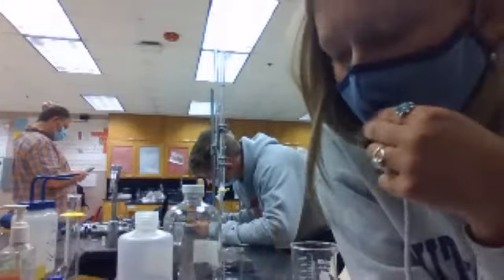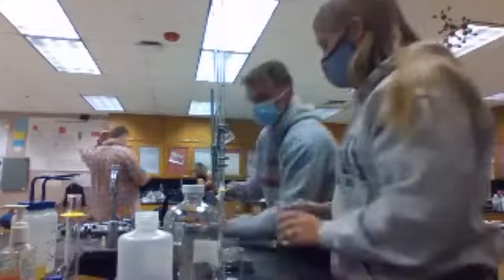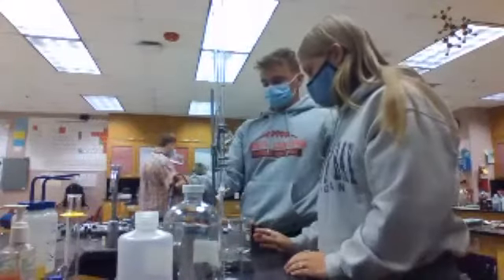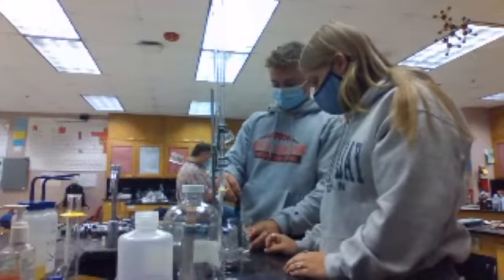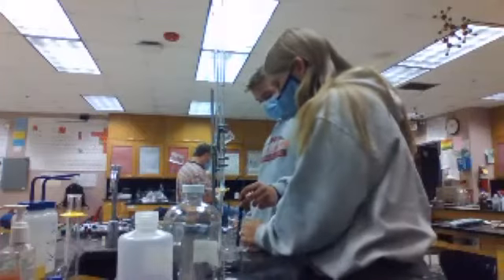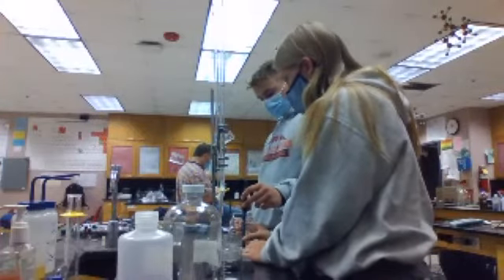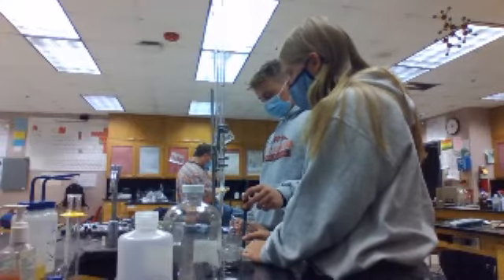Okay. So now we're going to take the pH of that. 9.9077. Cool. Yeah, that's actually about what we got, milliliter wise.